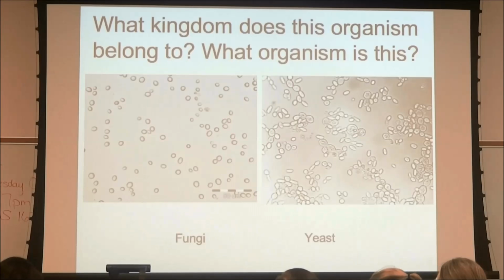But how did you know it was yeast and not coccus? It's bigger? Because they're not all different shapes. No. Okay, they are transparent, but you could get living bacteria too, which would be transparent. How do you know that this is a fungus, not a bacteria?